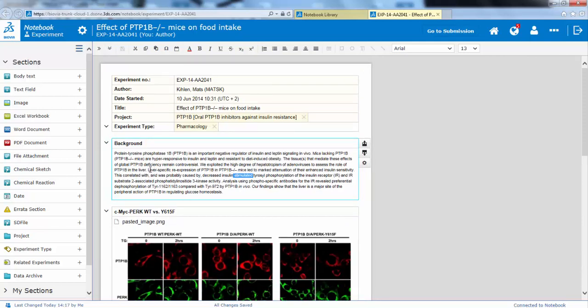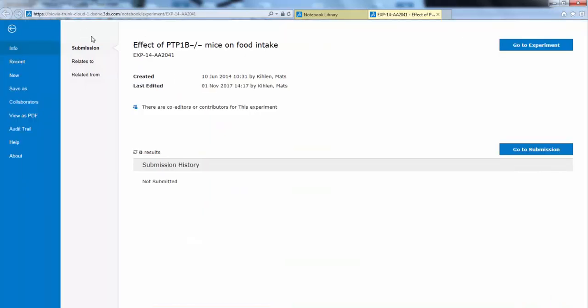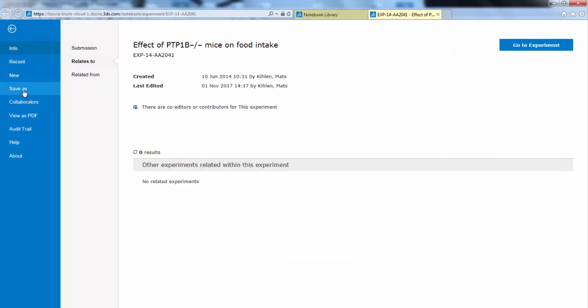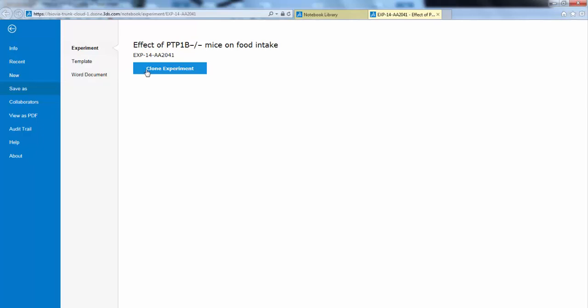Many of the functions that previously had been in the top bar have been moved to the cogwheel, so here you can find information about submission history. You can see where the related experiments are, if any. You can save as by cloning the experiment. You can save as a template. You can save as a Word document, which will also include all of the elements, all of the embedded files, and all of the file attachments into a zip file.